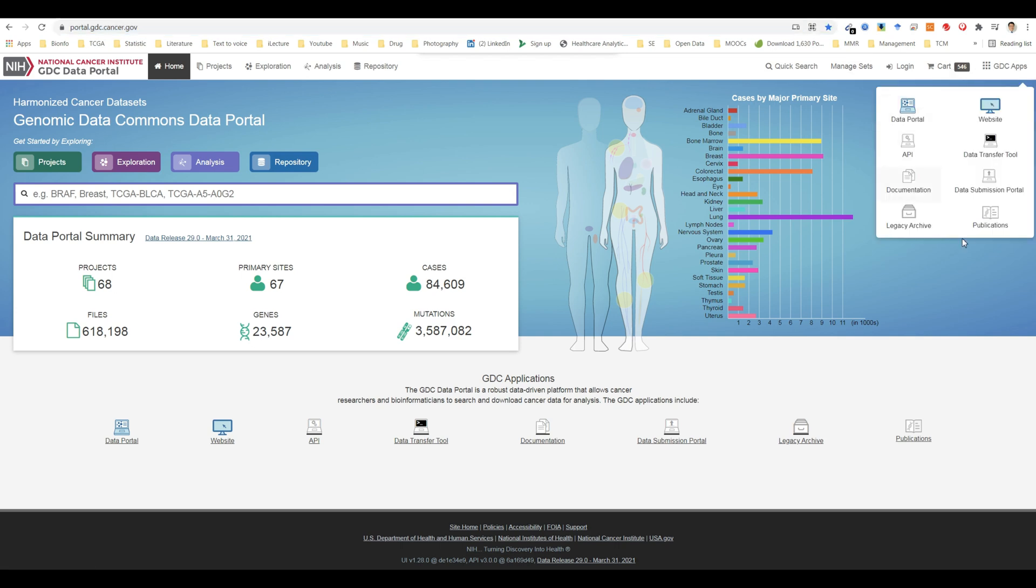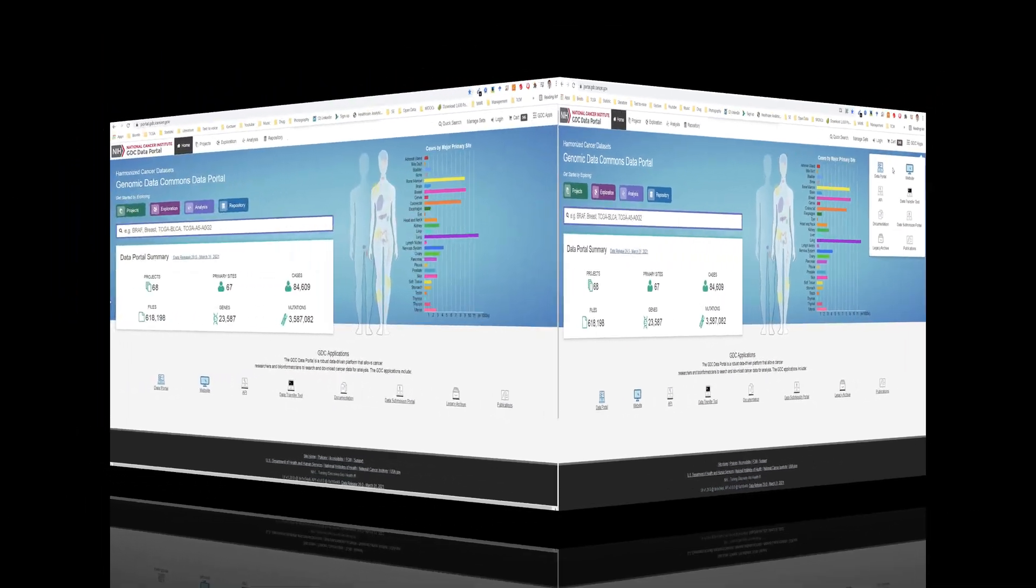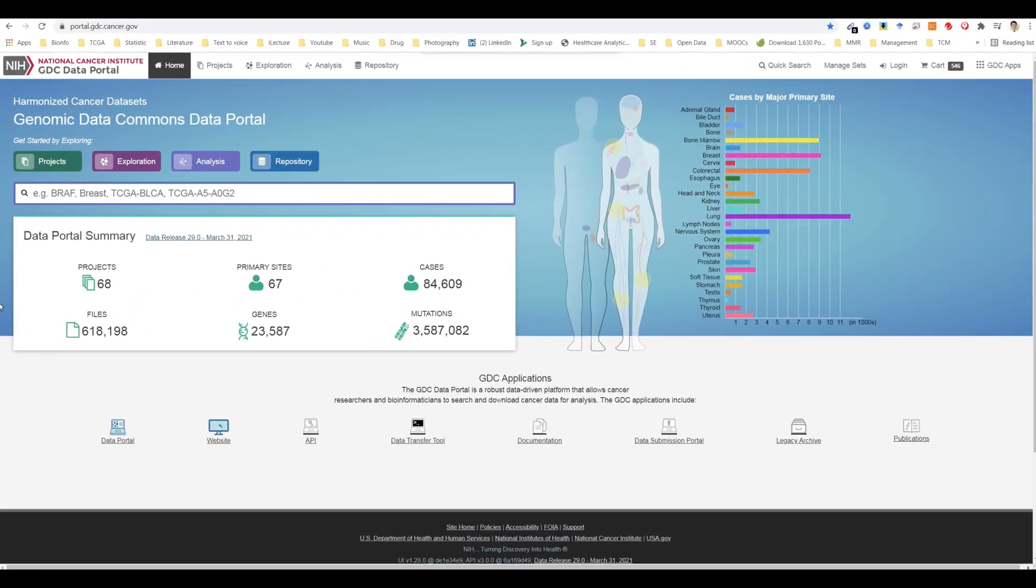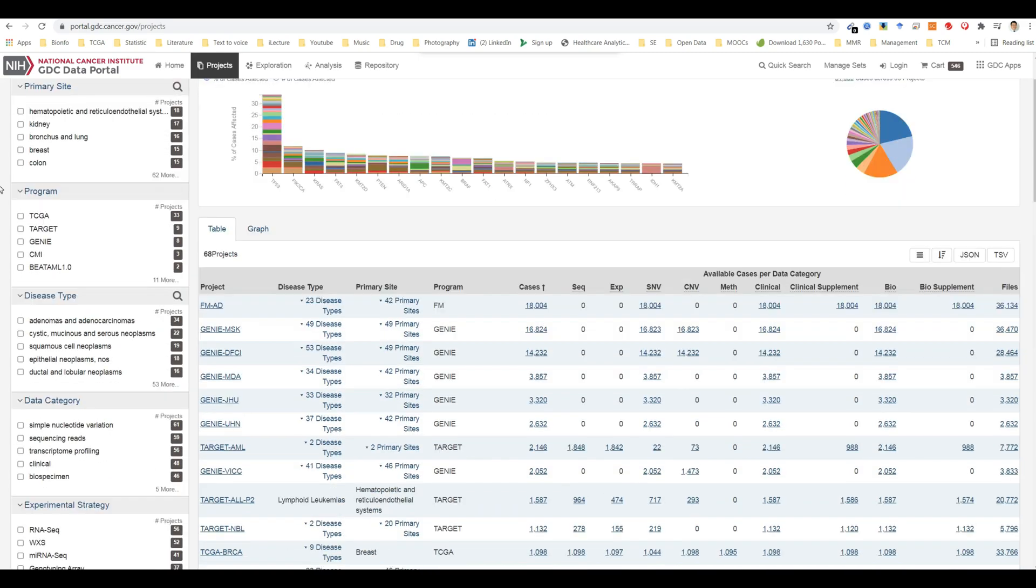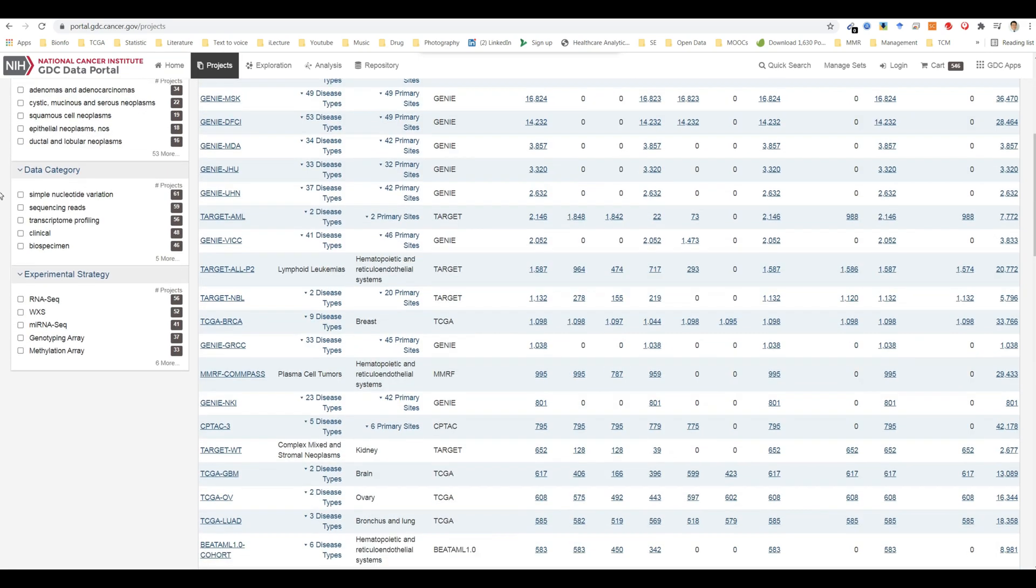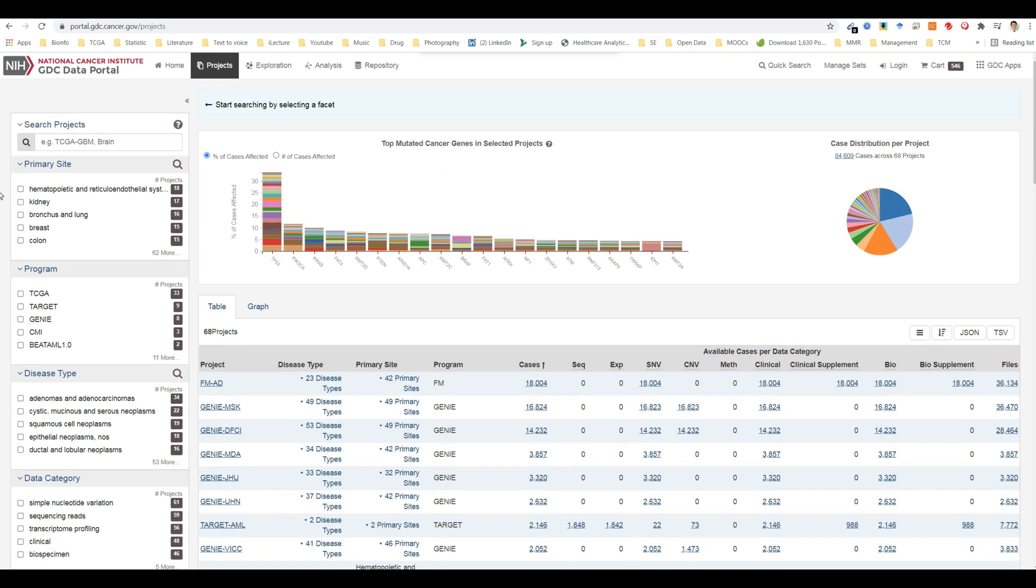The projects link directs users to the projects page, which gives an overall summary of project-level information, including the available data for each project. It also provides filtering, navigation, and advanced visualization features that allow users to identify and browse projects of interest.